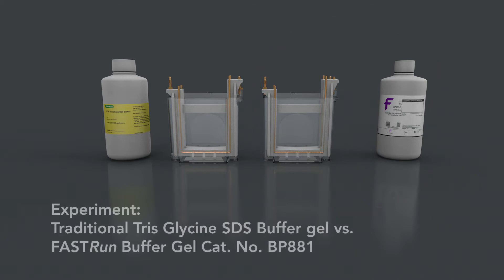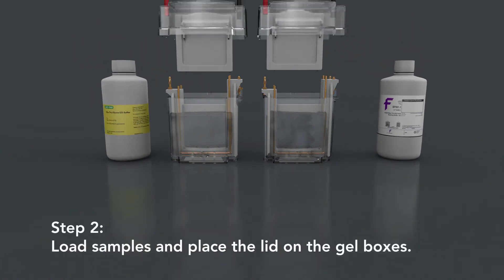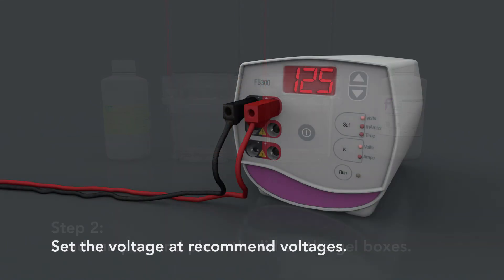See the difference for yourself. Our experiment compares the Fast Run Buffer with traditional Tris-glycine buffer gels. Step 1: fill gel boxes with buffers. Step 2: load samples and place the lid on the gel boxes. Step 3: set the voltage at recommended voltages.